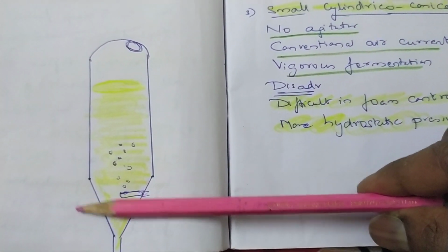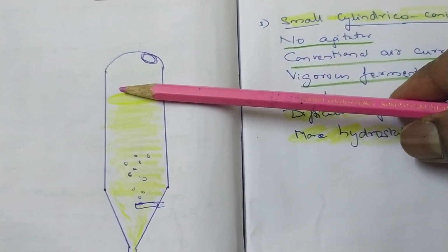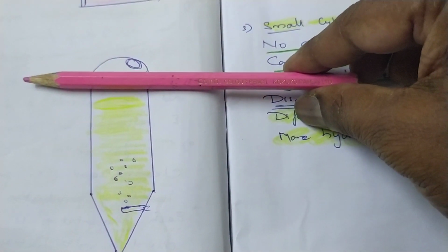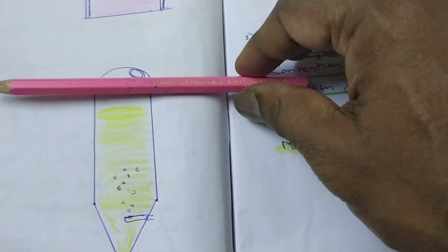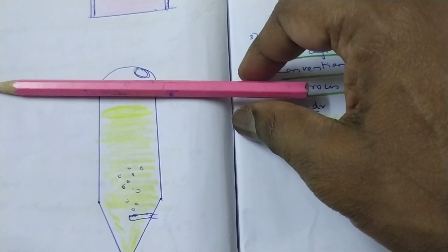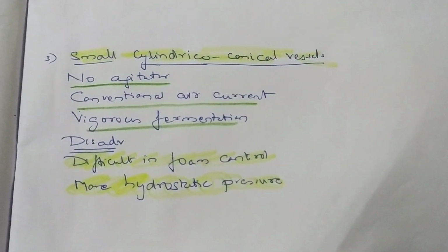So you can see that this will be the ground floor in the industry, first floor, second floor, third floor. This is how a bioreactor will be installed. Only the topmost floor, where I'm showing the pencil here, above that is only the top floor. Any person in the top floor will see through the glass viewer, which is seen here. Through the glass viewer, he will see the fermentation process and all. Anyway, this is for monitoring. Remaining all are automatic systems. This is a modern bioreactor, not a traditional one like the other ones.